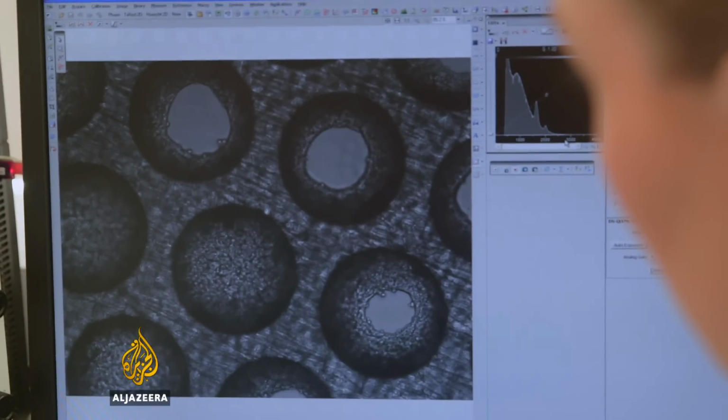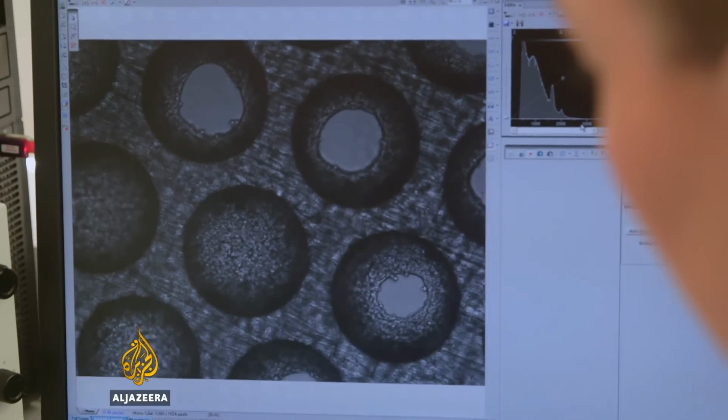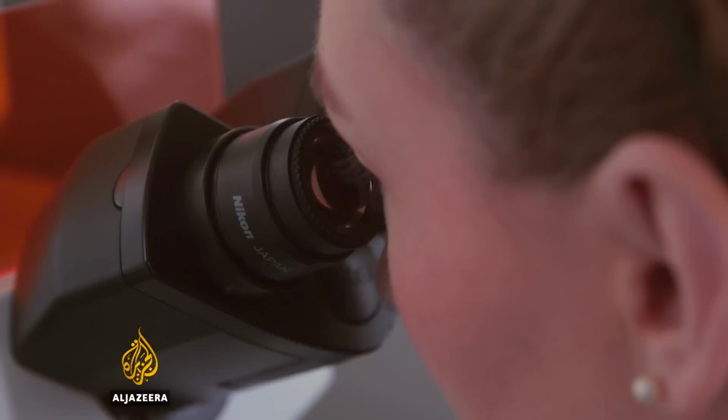So we're kind of bypassing the traditional route in a way because we're able to just do a lot more tests a lot more quickly. We're really trying to accelerate the process of drug development by making it a lot more efficient, and particularly by enabling researchers to understand how the human will respond to a drug rather than using an animal as a surrogate for how a human will respond to a new medicine.